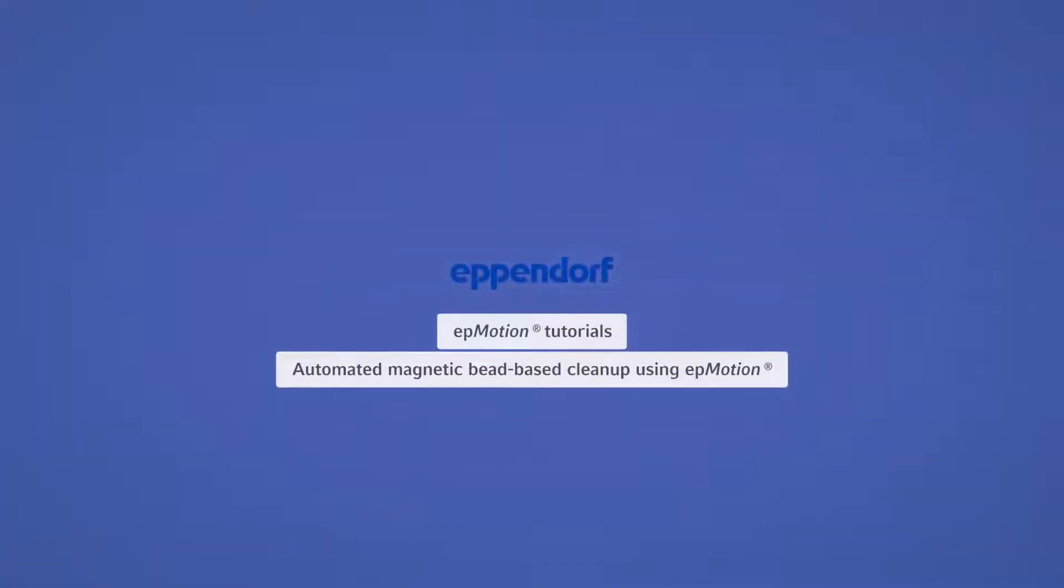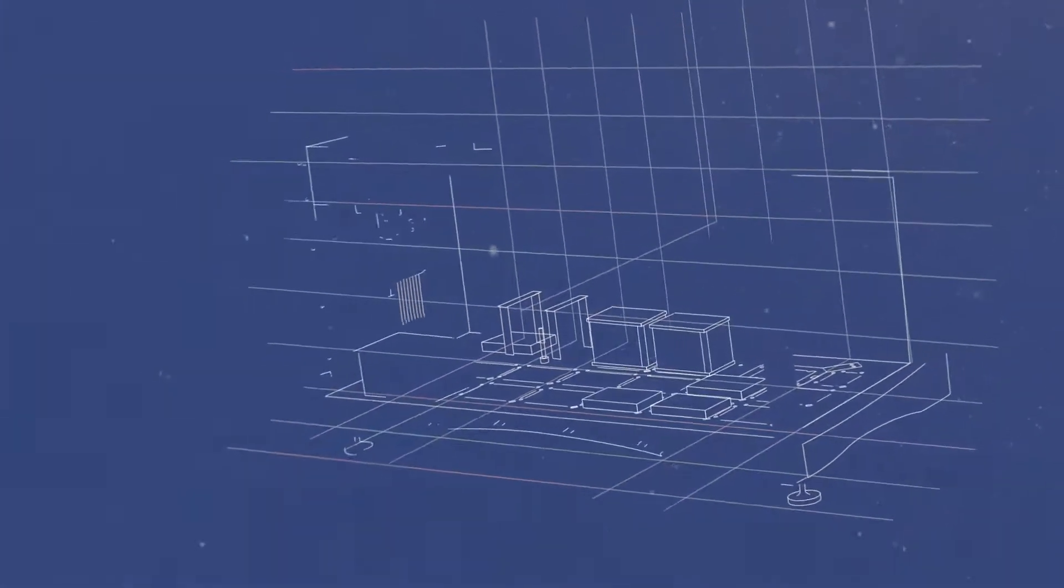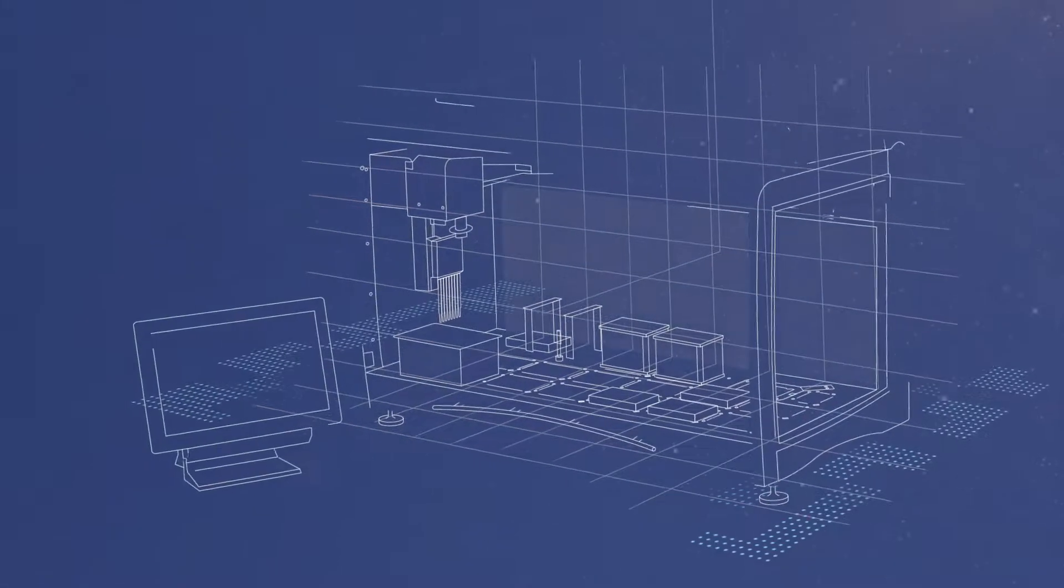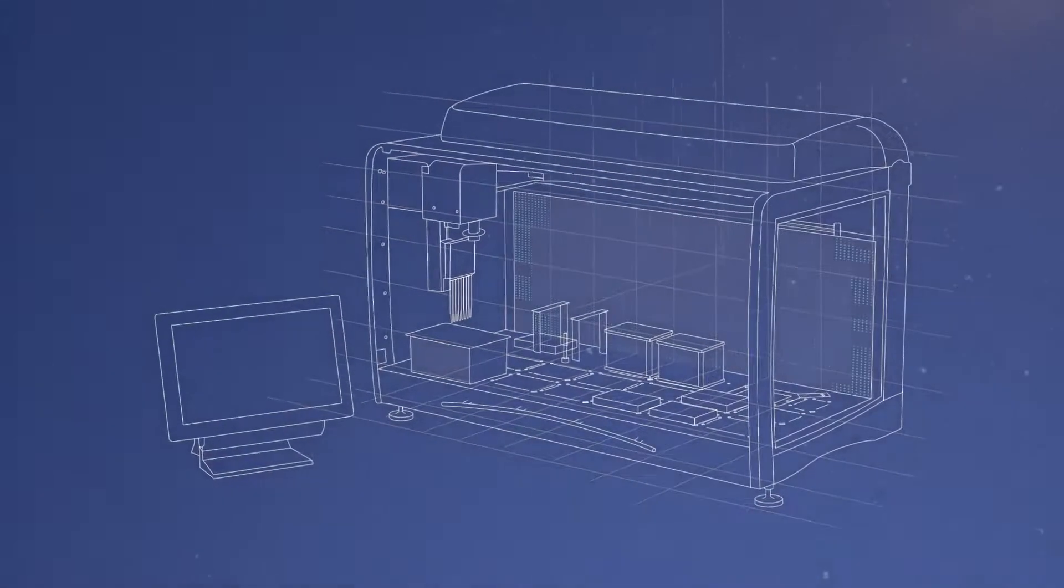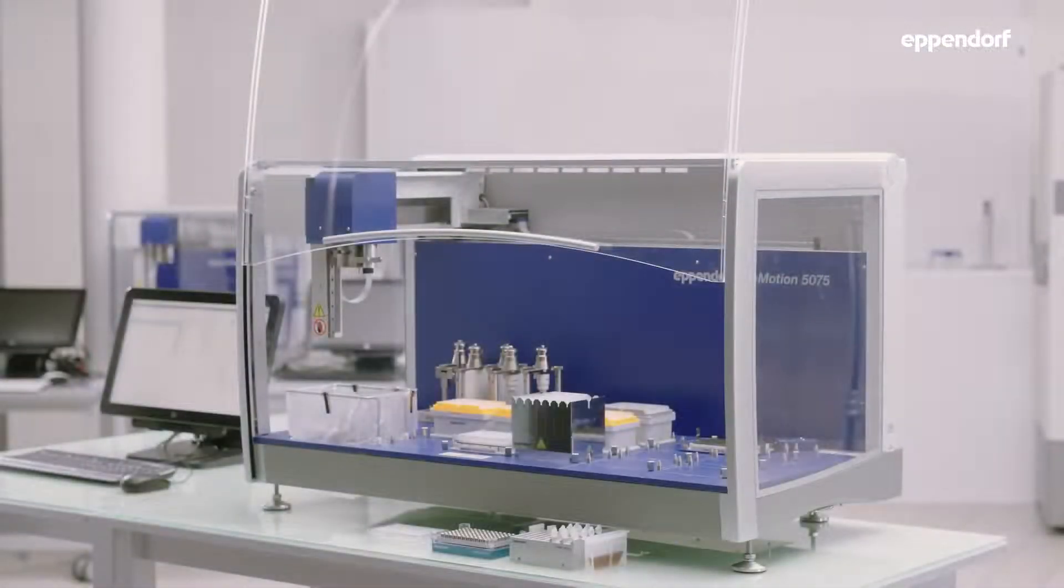Welcome to the tutorial Automated Magnetic Bead Based Cleanup using EP-Motion. Bead cleanups are some of the most common and repetitive steps in applications such as NGS library preparation. The EP-Motion can be of great help here.